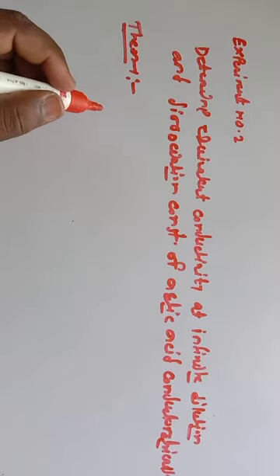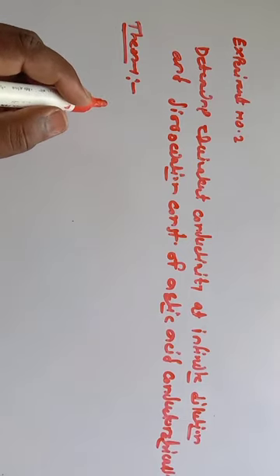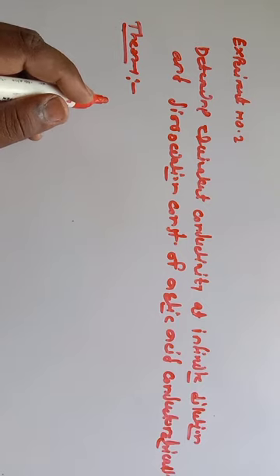Good morning, dear student. In today's lecture, we discuss the second experiment from your practical course CHG 290: to determine the equivalent conductivity at infinite dilution and the dissociation constant of acetic acid by conductometry.